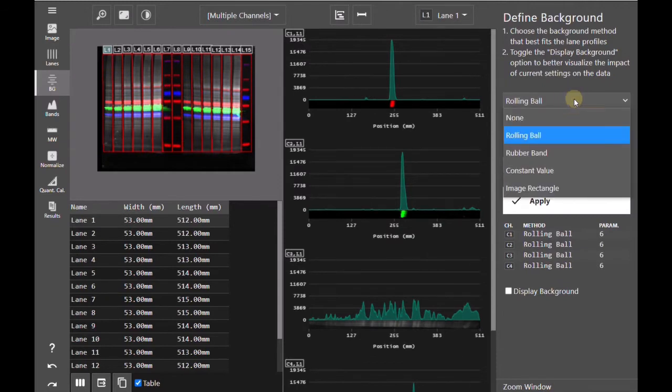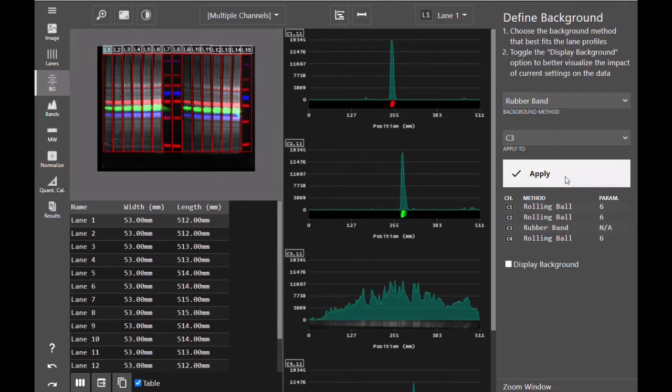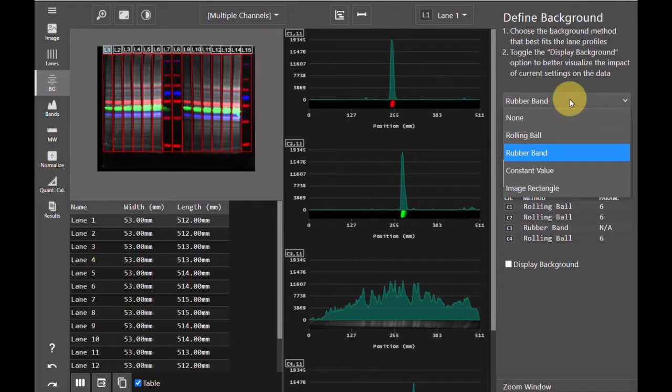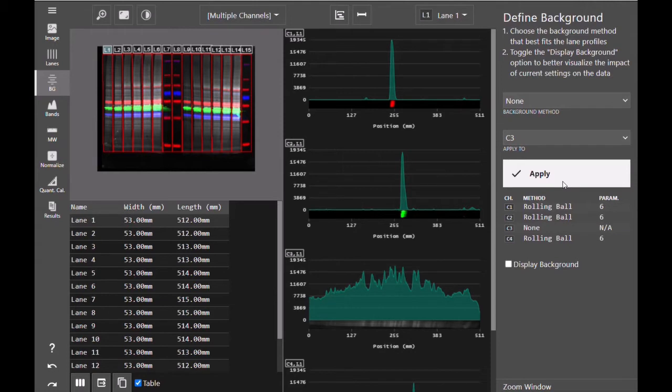Because rubber band fits a rubber band up to the edges of the profile of your lane, this effect is not quite as drastic as it is with rolling ball. However, it does subtract a lot of signal compared to not subtracting any background at all. And depending on the strength of your total protein stain, rubber band could still in some cases subtract quite a bit of your total protein signal.